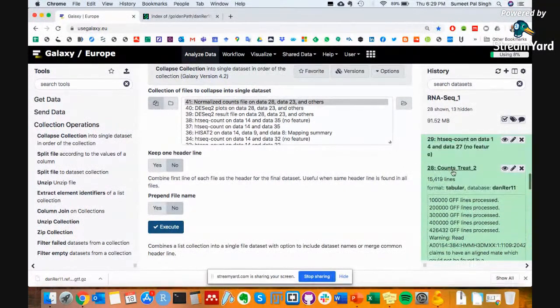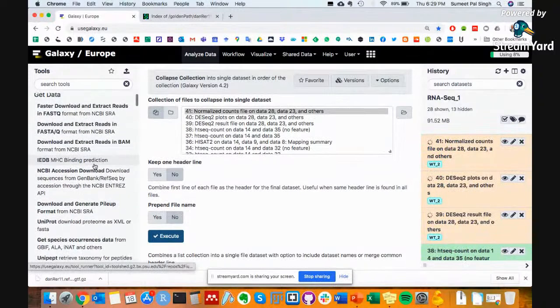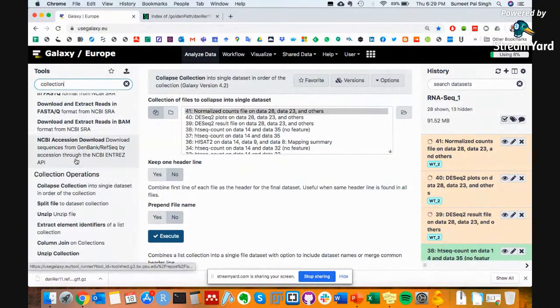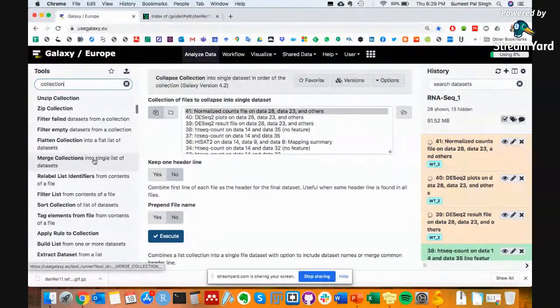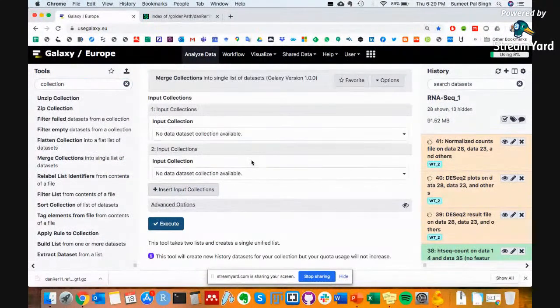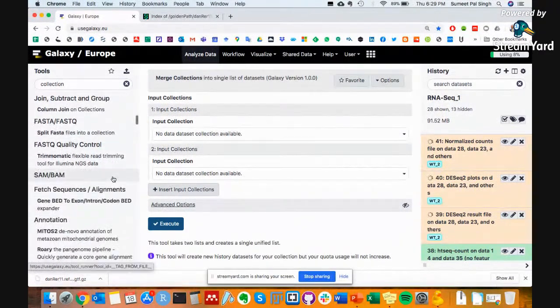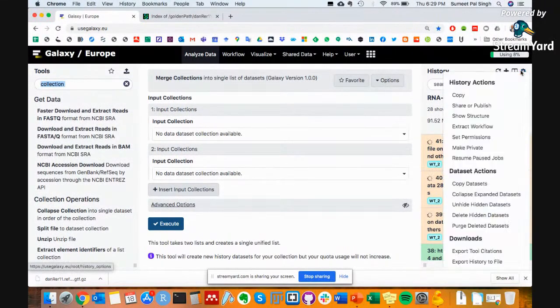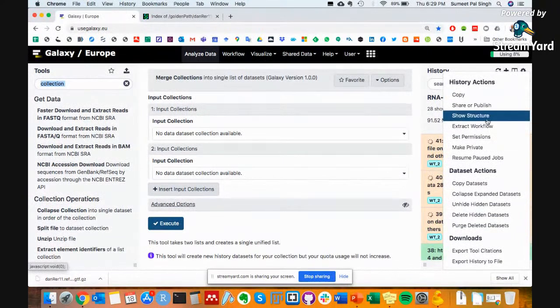Okay. Let us check here, collection. Structure, copy or publish.